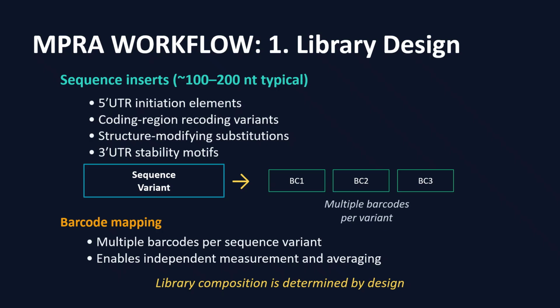This provides technical replication and helps estimate measurement noise. From here, everything downstream, that is transfection and then eventual expression, sequencing, all those things, are constrained by what was encoded in this library.